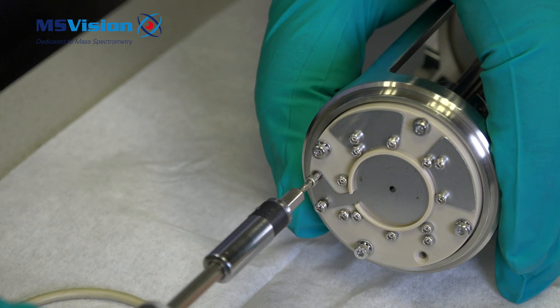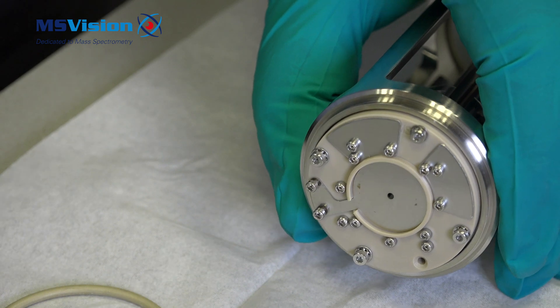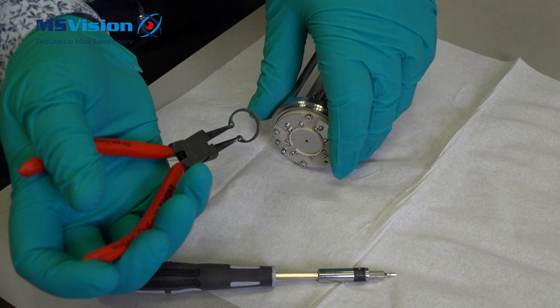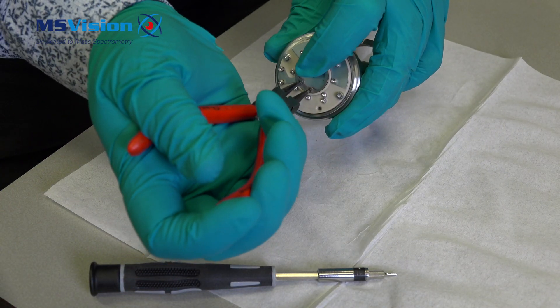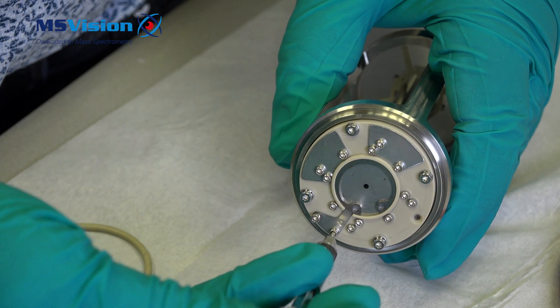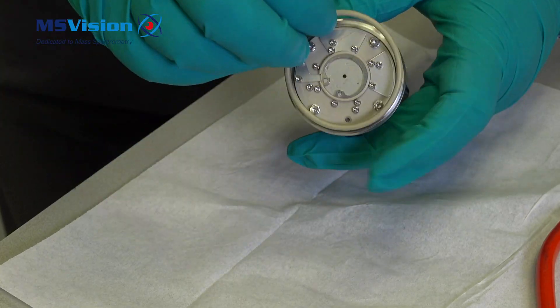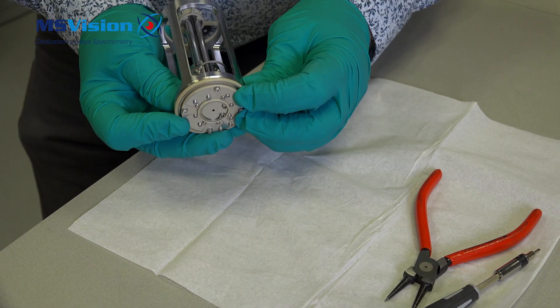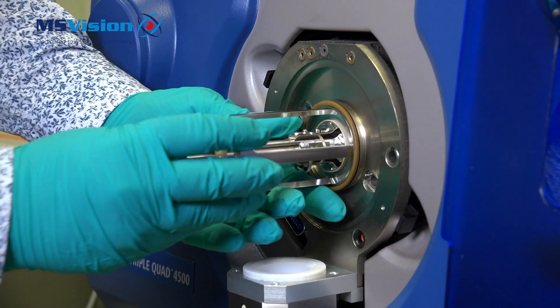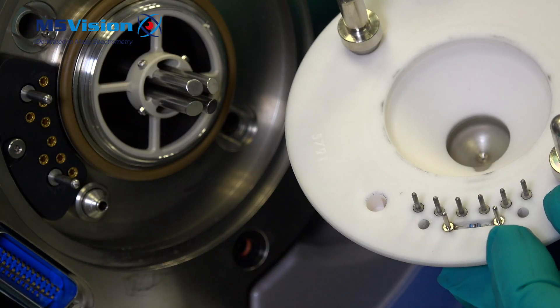Then replace the lens by putting the hex screws into position, then put the circlip into place as shown. Then tighten the hex screws. Replace the Q-Jet, orifice plate, curtain plate, and the source as shown.